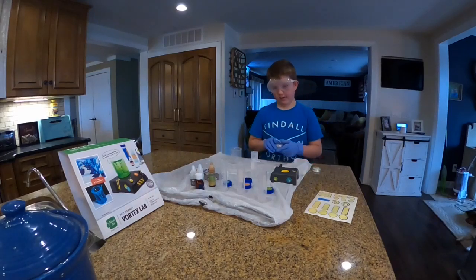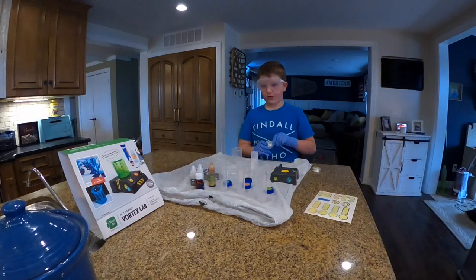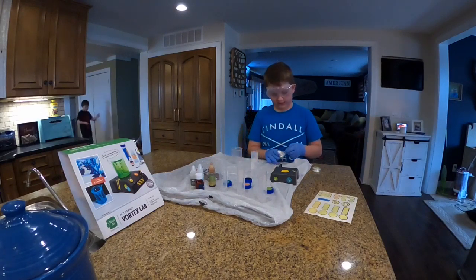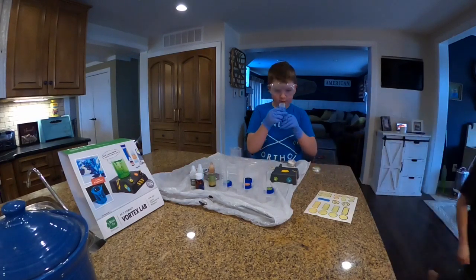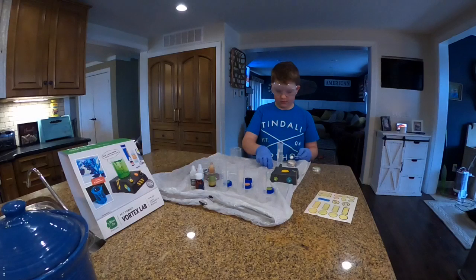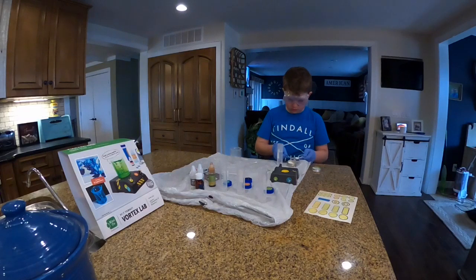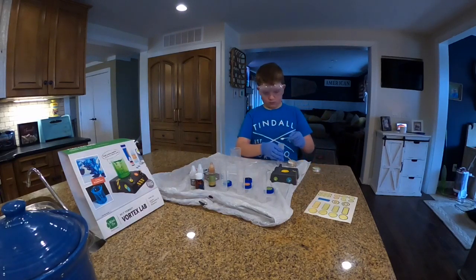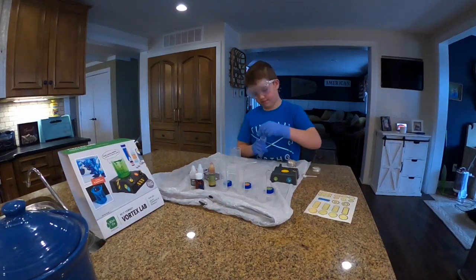Today we are doing the fourth activity in the Vortex Labs. We've already got 35 milliliters of hot water in test tube A. Now you need a level scoop of ascorbic acid, then put that in the tube, cap it, and shake it.